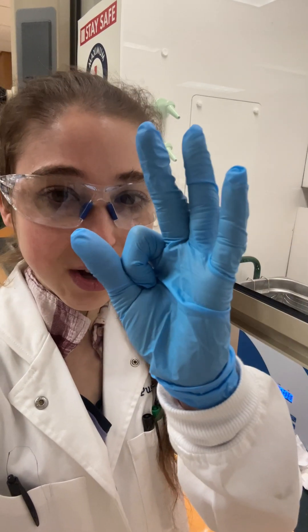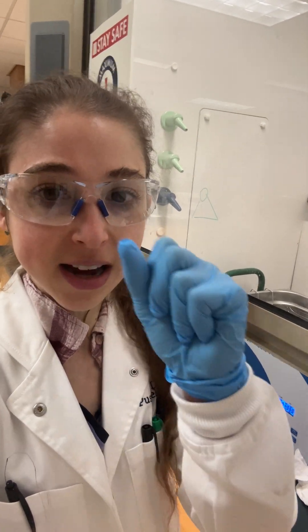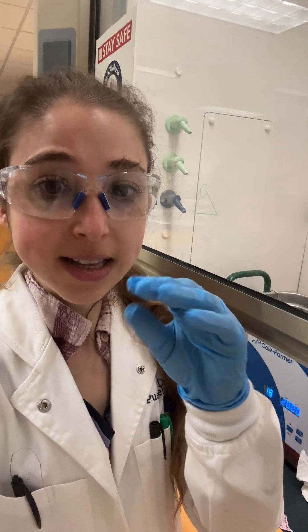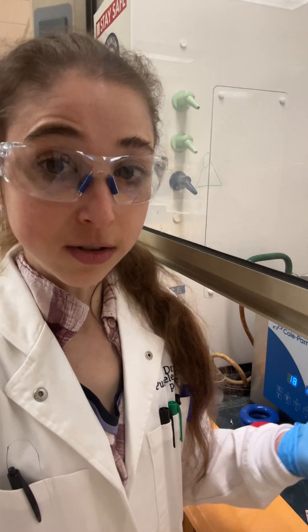Those little salt crystals might seem so small, but there are actually a lot of molecules and a lot of hidden surface area inside them. If you break that up with sonication, you're increasing the amount of surface area exposed to the solvent, allowing you to get better solubility and dissolving.